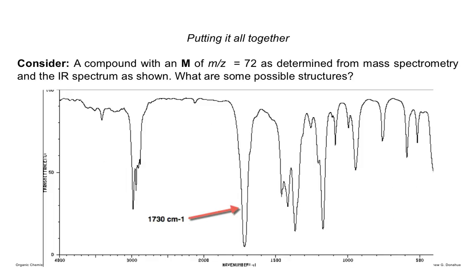So I'm going to throw this out here, and then I'm going to pick a little bit of some information out, and then we're going to go back and sort of analyze the spectrum itself. But this is what an infrared spectrum looks like. On the x-axis, the unit is called wave numbers.